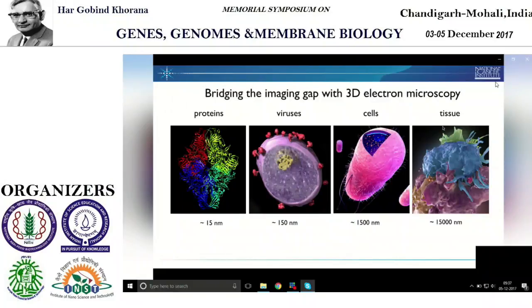And finally, I haven't mentioned work we're doing to use these methods to look at very large structures, tissue in 3D, using a technology called focused ion beam imaging, which I originally saw in the semiconductor world, but which is now brought over to biology to look at tissue. The main focus now is to look at this in the context of cancer, to differentiate normal cells from transformed cells, and in the context of aging, to understand changes in mitochondrial structure as we go through the aging process.